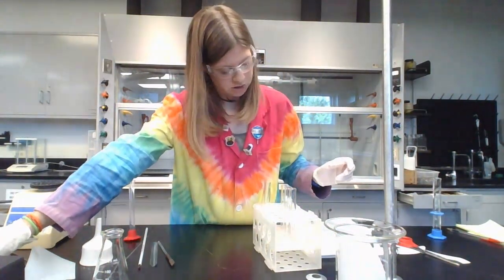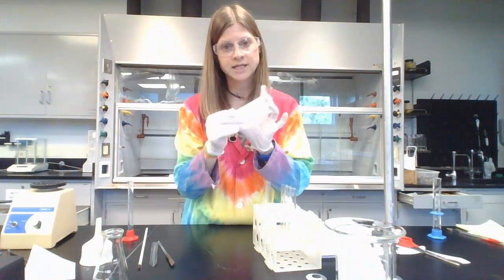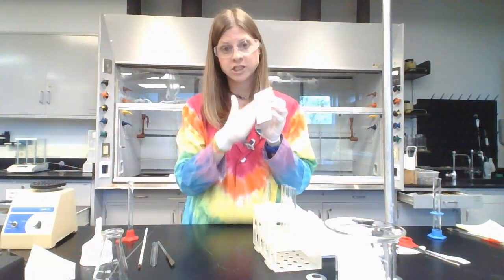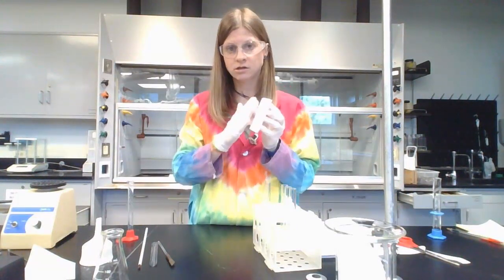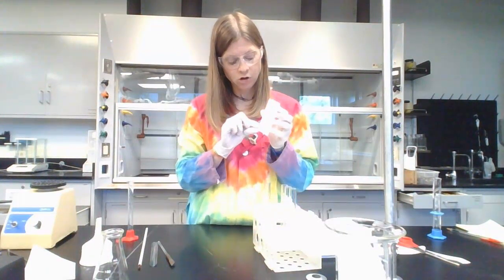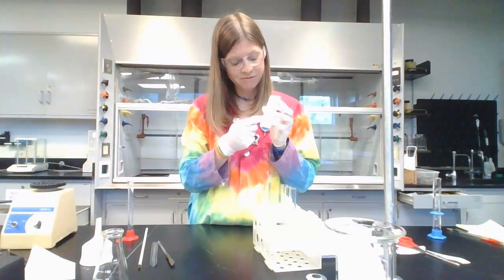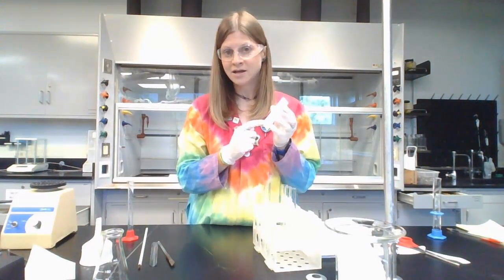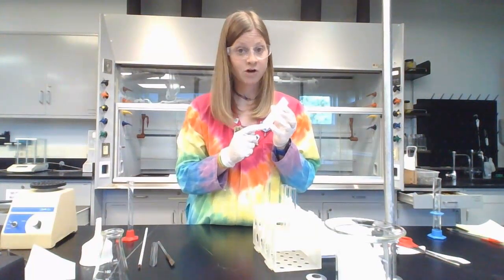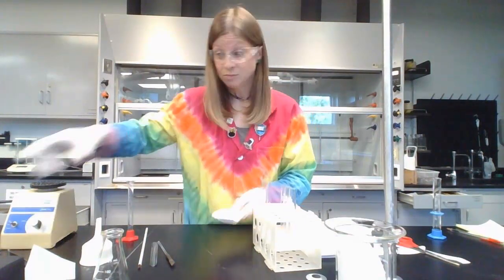To do our thin layer chromatography, we need a TLC plate. TLC plates are glass on one side and have a solid coating sprayed on them on the other. The solid coating is the side that we're using, and it's going to serve as the stationary phase. So using a pencil, we have to get this prepared. You're going to go 1 centimeter from the bottom, draw a straight line over. Then we need to have 3 evenly spaced tick marks that you're going to label underneath them, like SA for salicylic acid, A for aspirin, and P for product. Okay, so it's all ready to go. And again, it has to be in pencil.